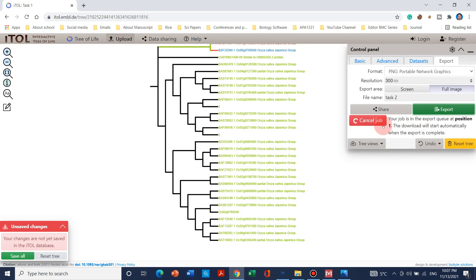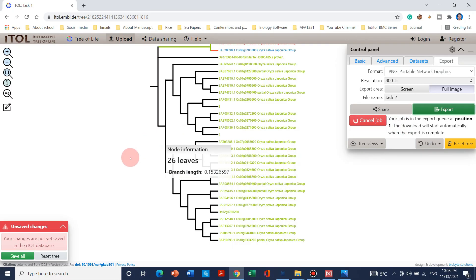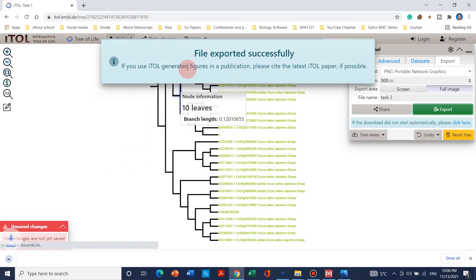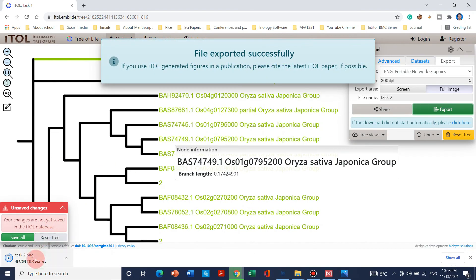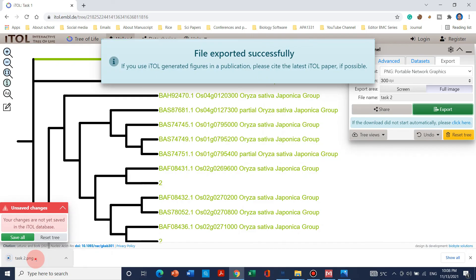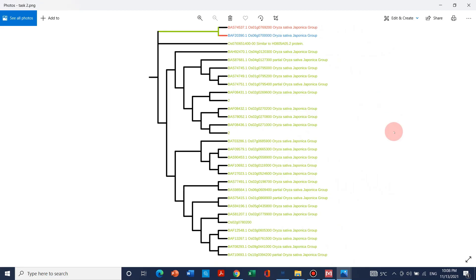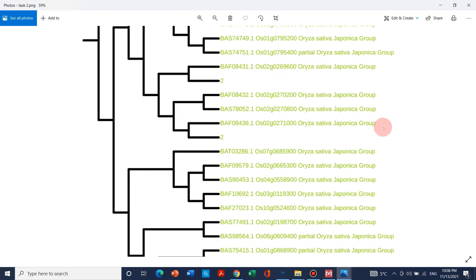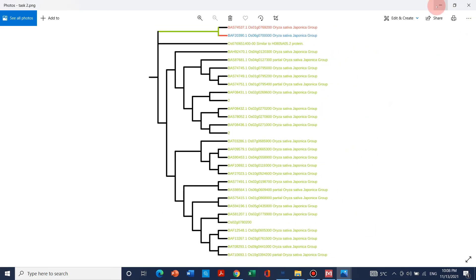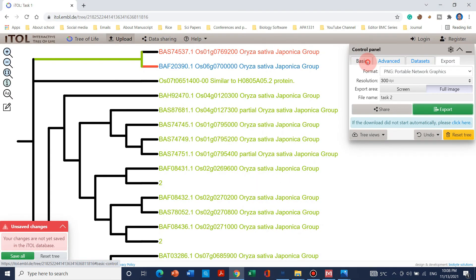You will again get a queue position. Once the file is exported successfully, you can see that this figure is looking beautiful. You can use this for your manuscript submission.